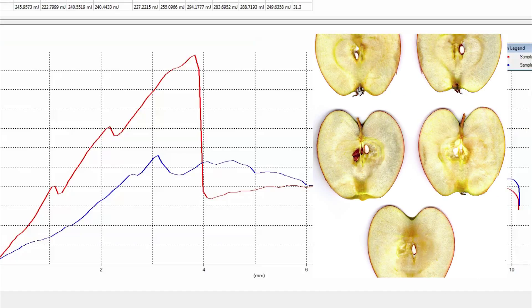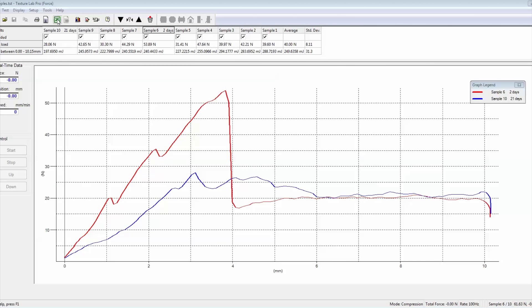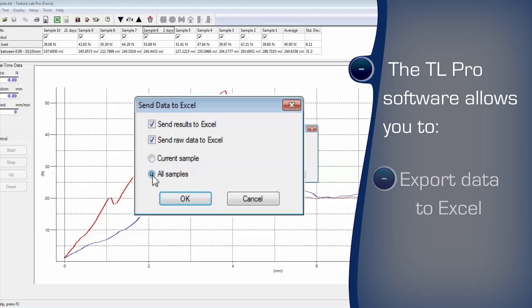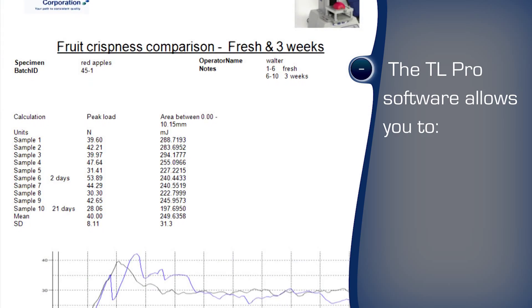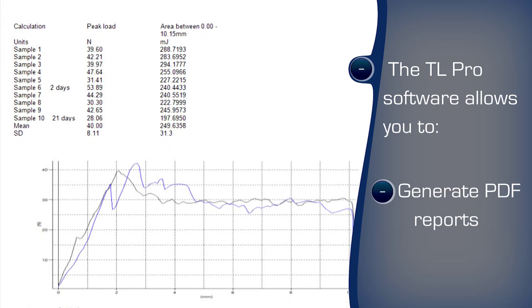Loss of moisture over time can cause the texture to become crumbly and mealy. TL software can export to Excel for further examination and traceability and format the results in a user customizable report style.